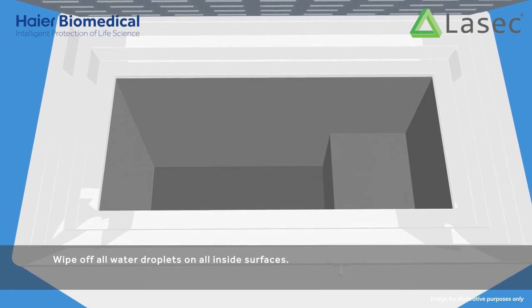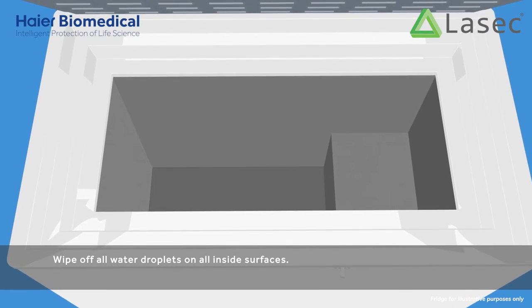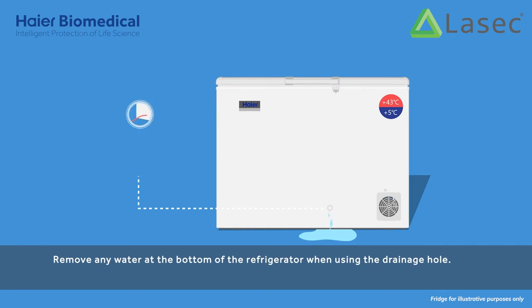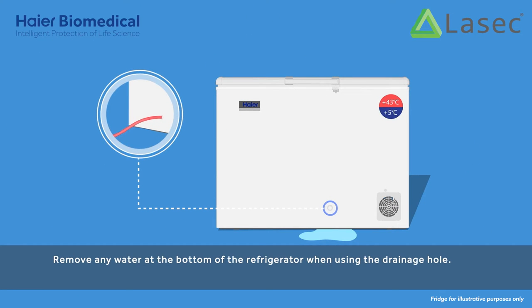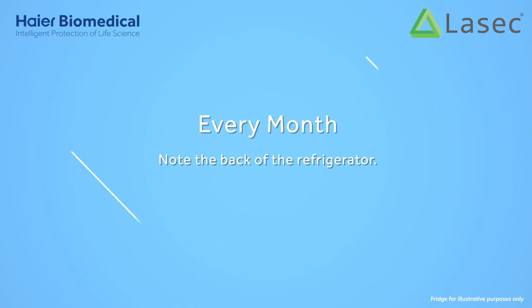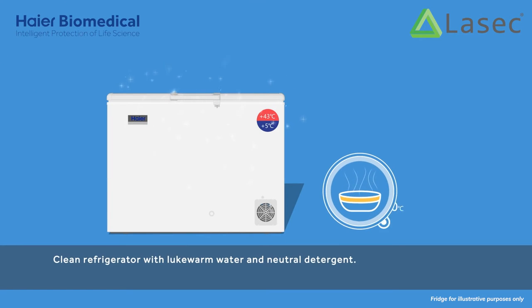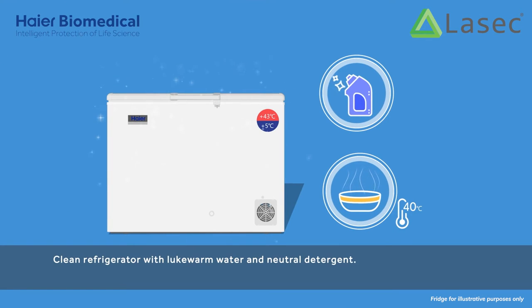Wipe off all water droplets on all inside surfaces. Remove any water at the bottom of the refrigerator when using the drainage hole. Clean the refrigerator with lukewarm water and neutral detergent.